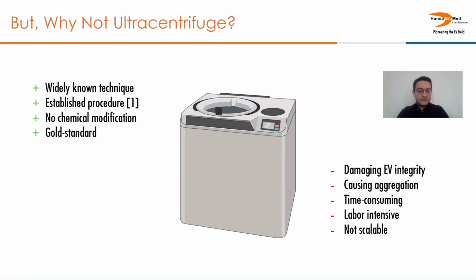And then there are also disadvantages from a user experience point of view, including its time-consuming nature, meaning that it requires hours to process even minor amounts of sample, and it is also labor-intensive, especially from a sample preparation perspective. And finally, it is not a scalable method at all, which is a barrier, especially for end applications, whether clinical or industrial. If you need to process more volumes, the only thing you can do is to purchase or acquire another ultracentrifugation equipment.